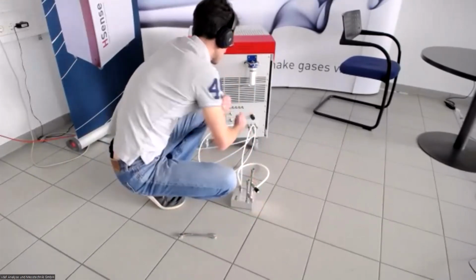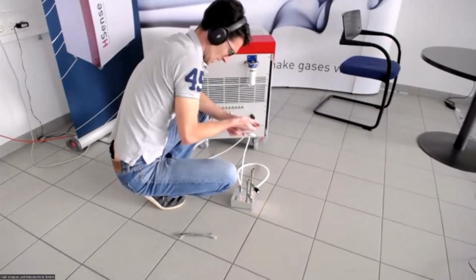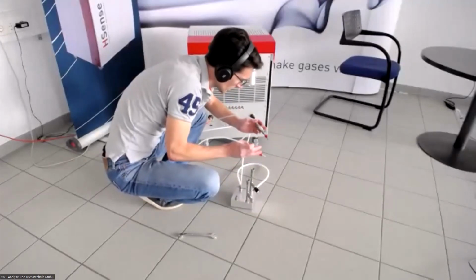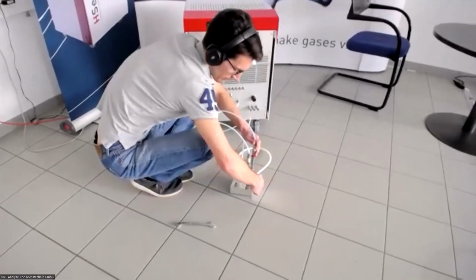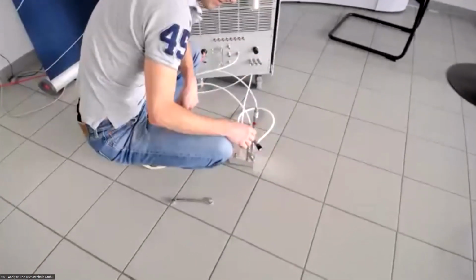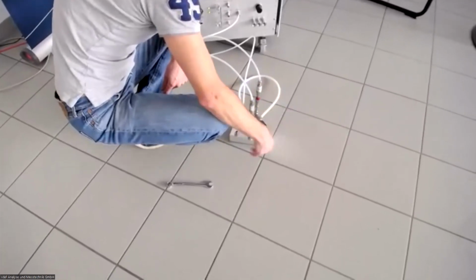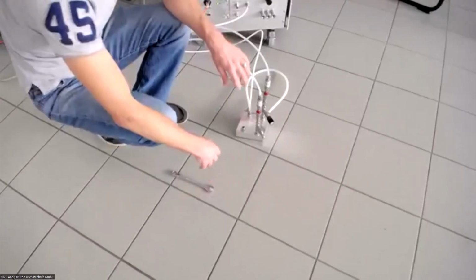Now we're pretty much going to check. We're going to take the gases that we have just used for calibration, and attach them to the chamber like this. You see here we have 2 needle valves, which allow us to open up each one of these inlets.